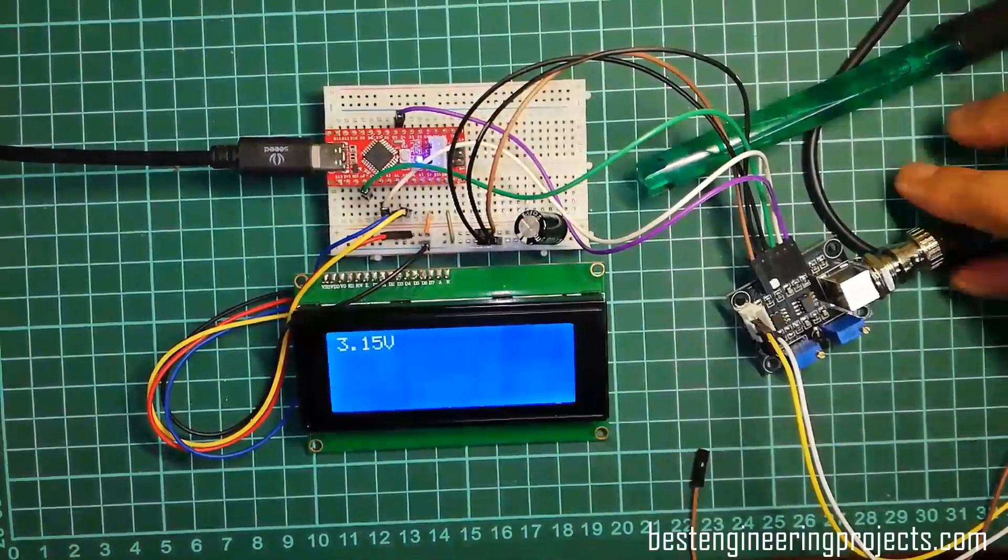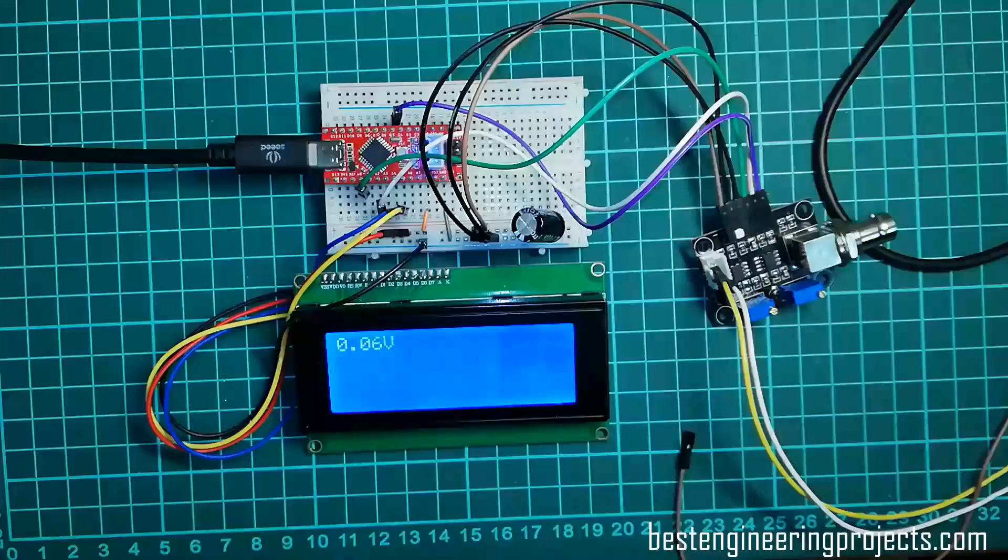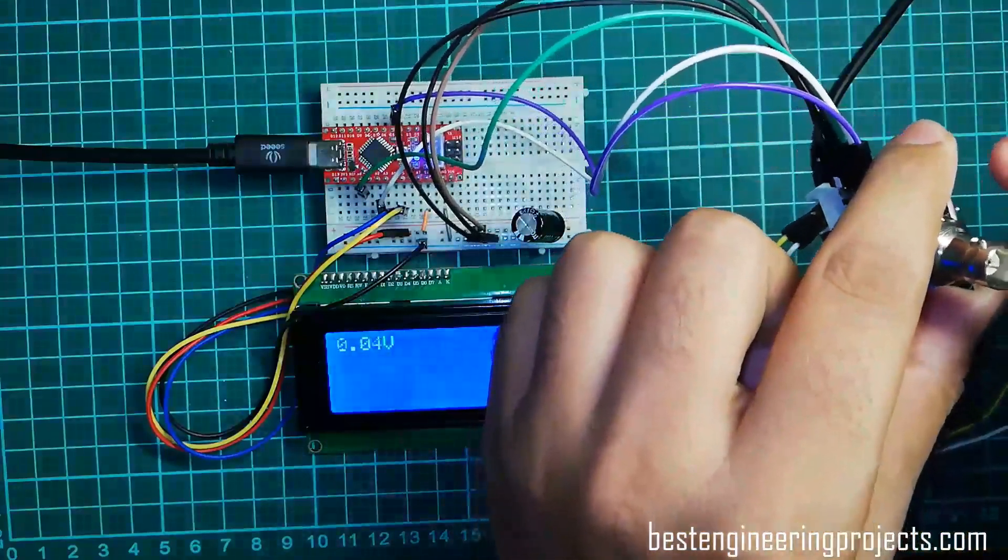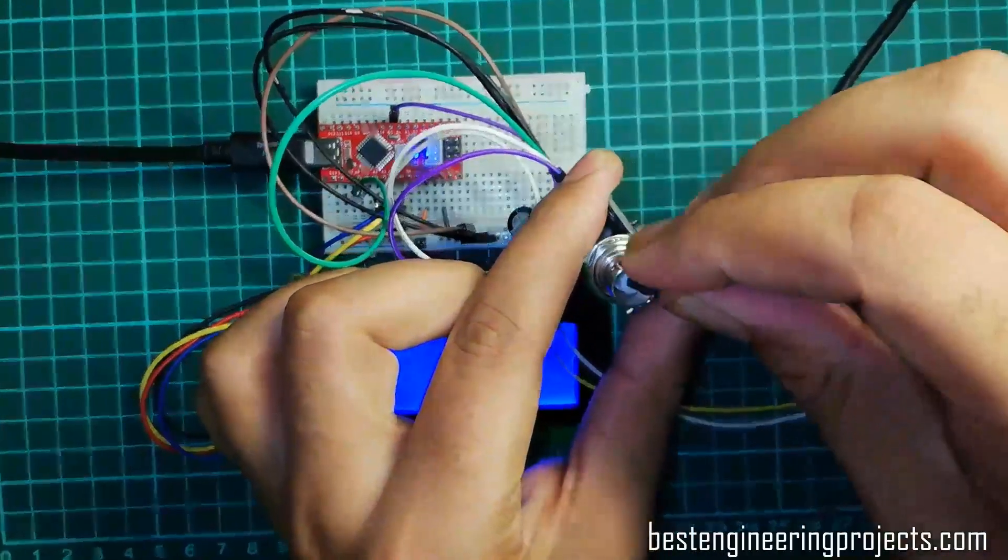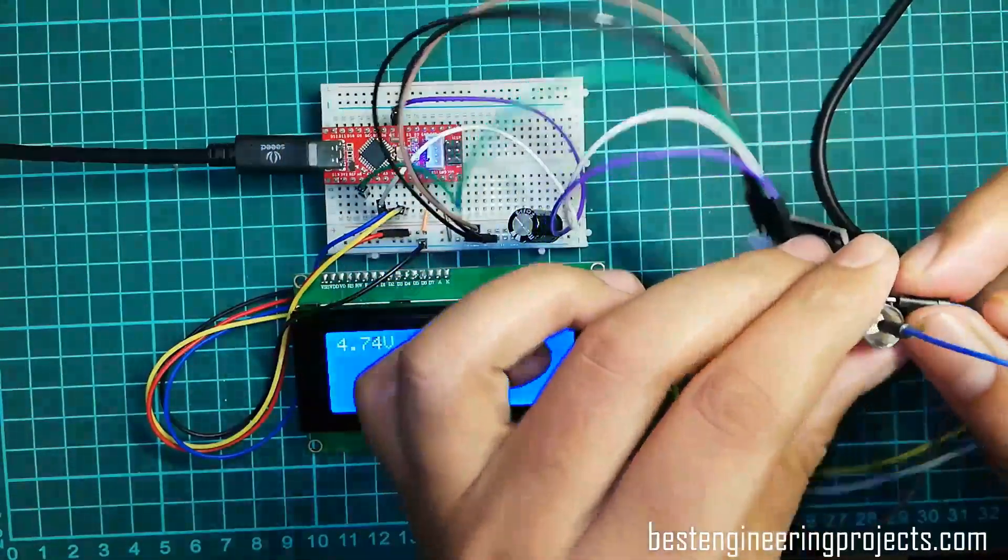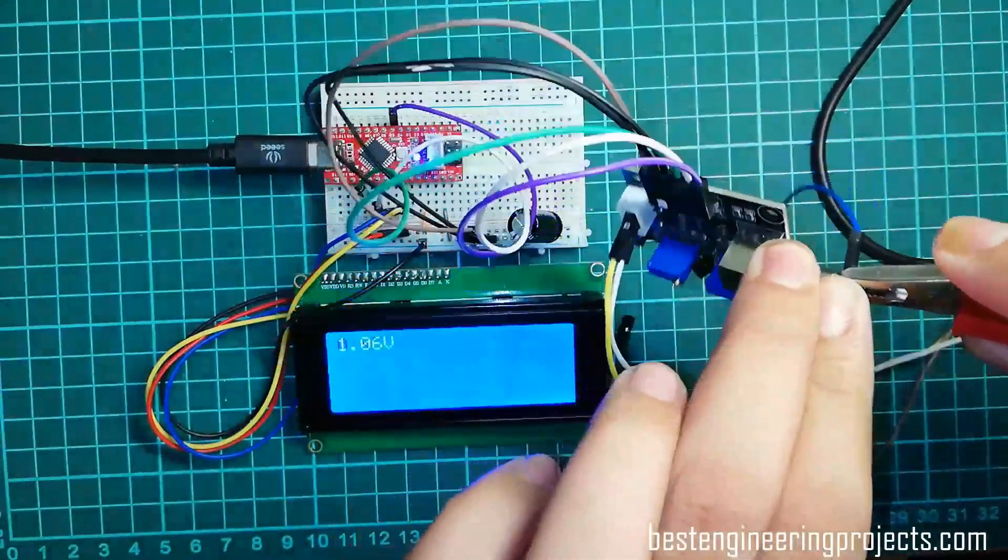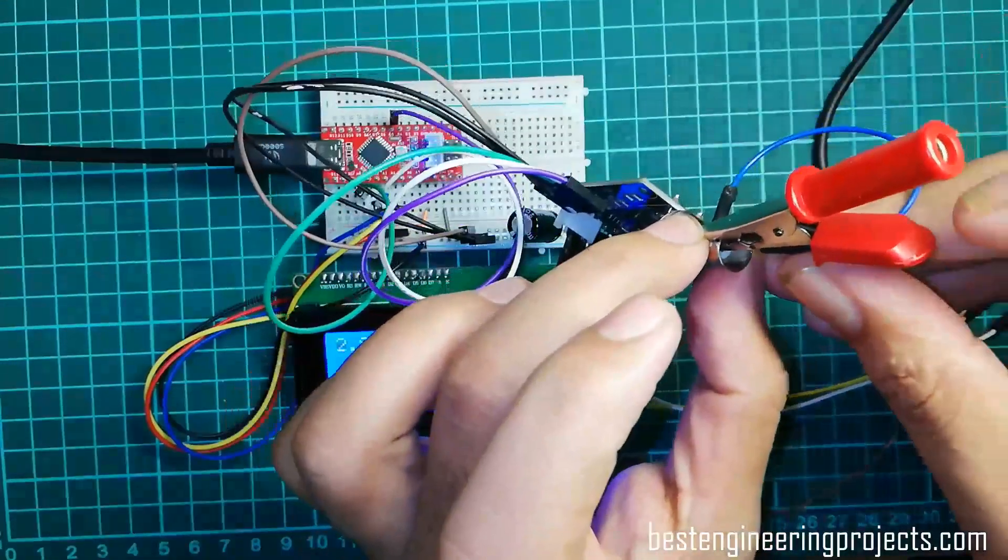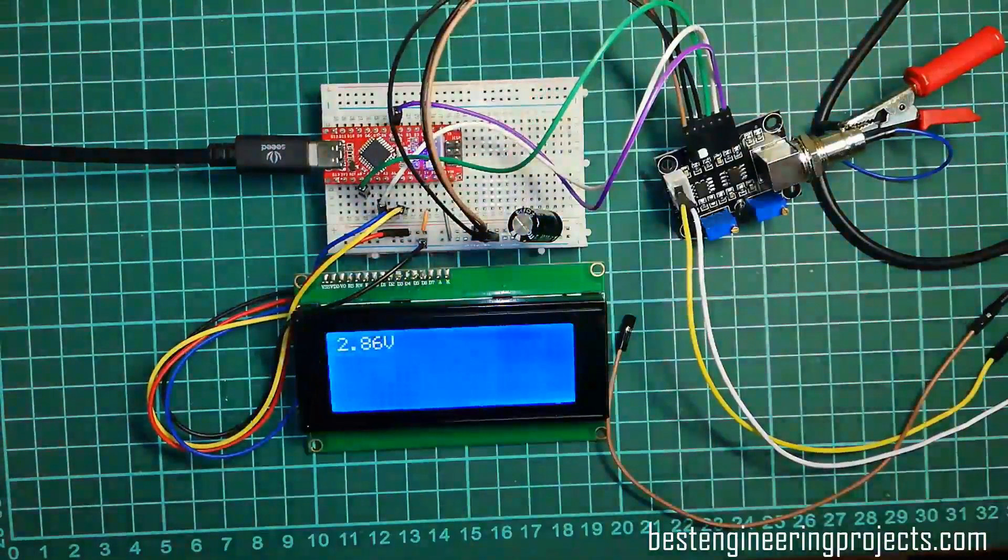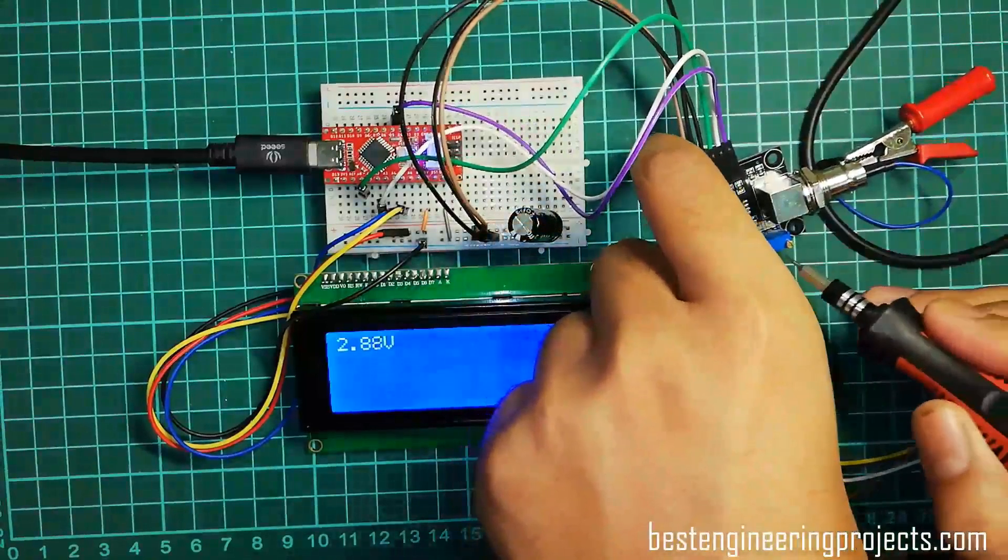Step 3: Remove this electrode from the BNC connector and then insert this inside connector with outside. For that, I am taking the help of this crocodile connector. And then, adjust this potentiometer for offset calibration, closer to the BNC connector.